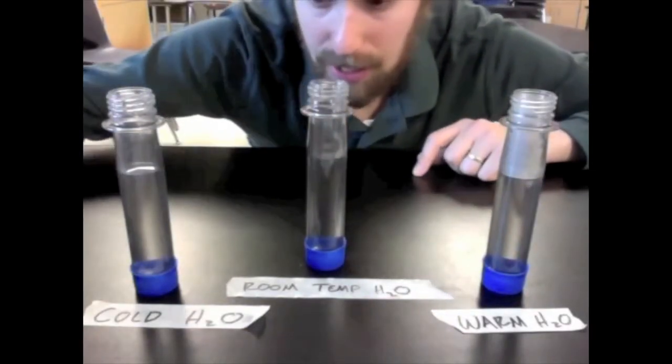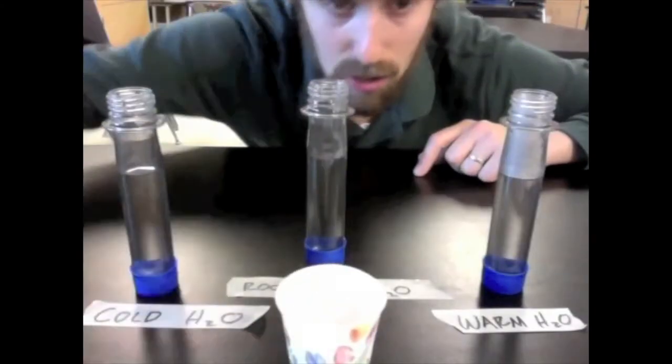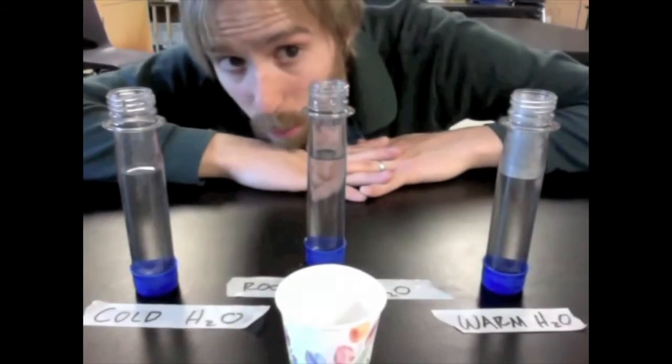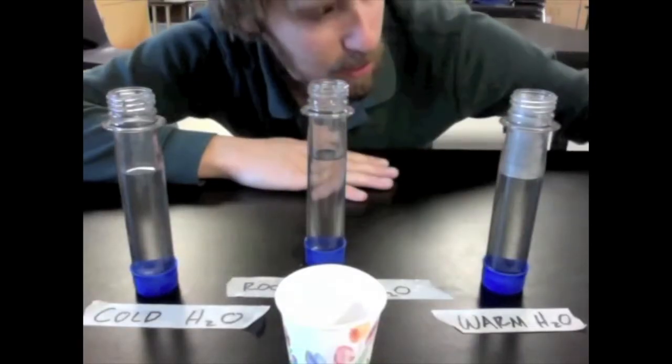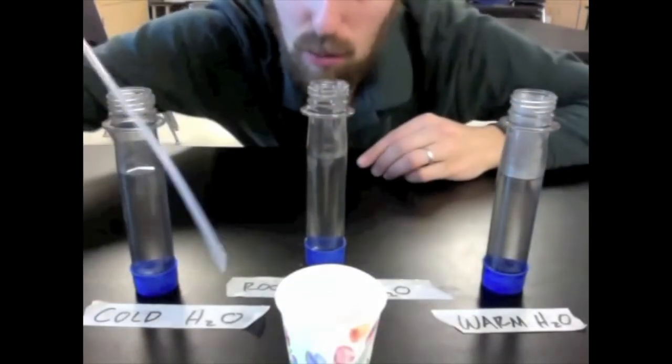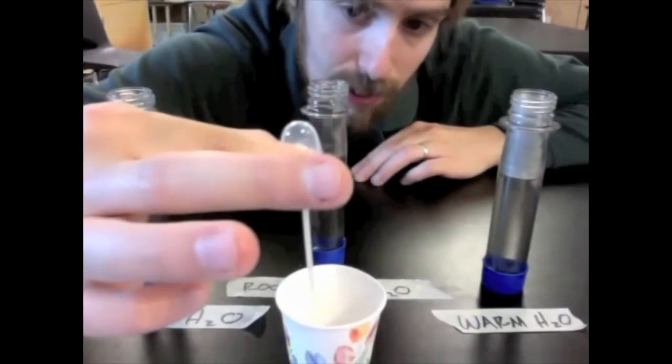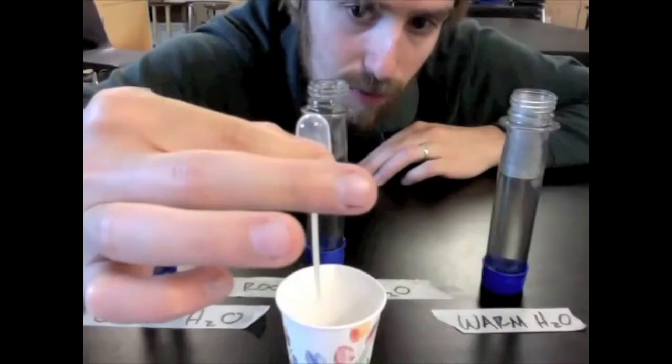Now what we're going to do here is take our yeast solution, which is just water, yeast, and a little bit of plain, everyday, white, granulated table sugar, and we're going to put a little bit of that into each one of these pipettes, hopefully just about the same amount in each so that we can control our variables.